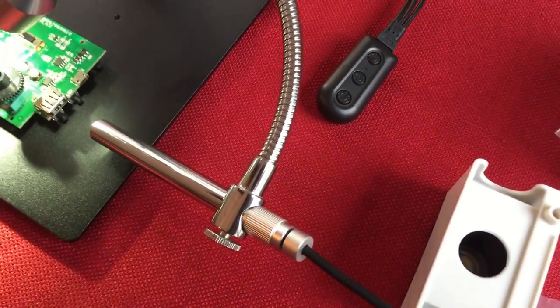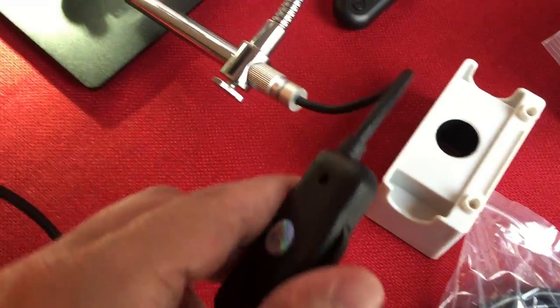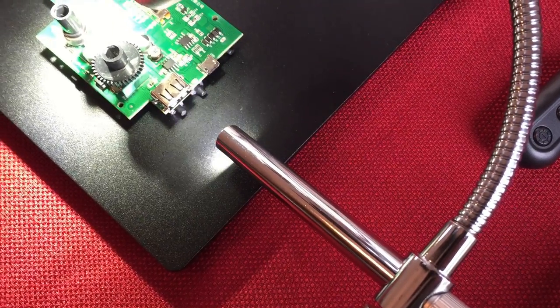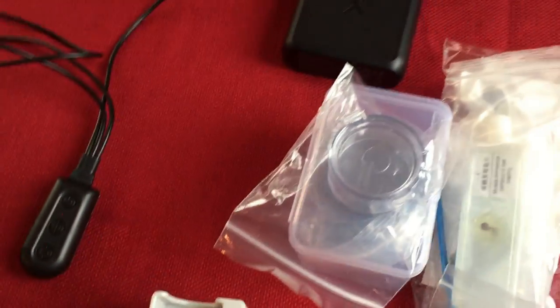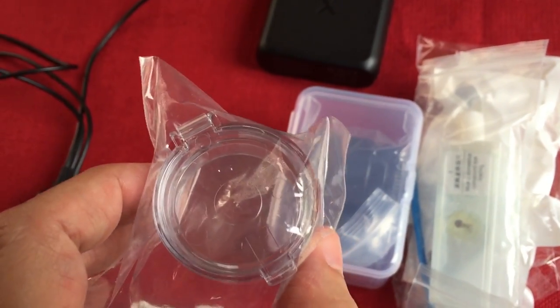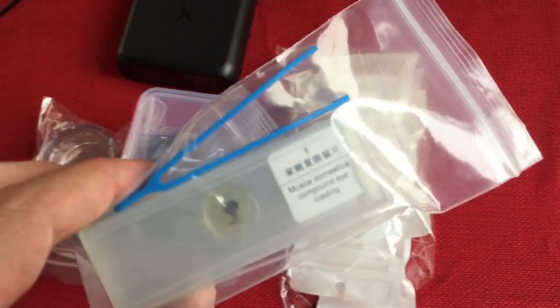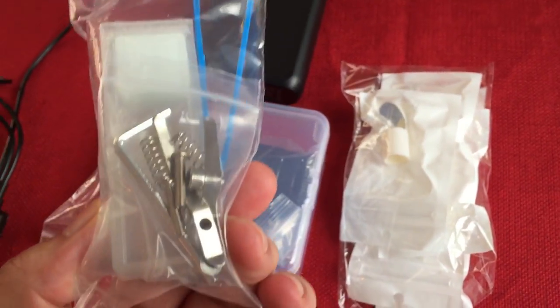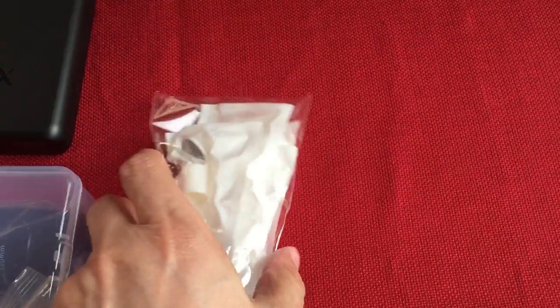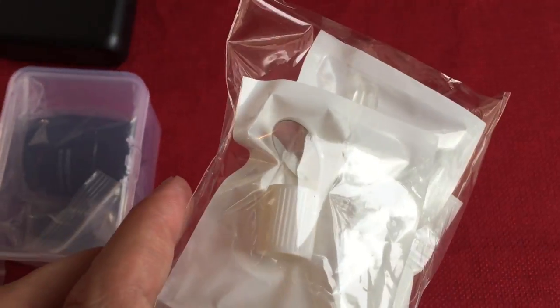There's the endoscope — very cool. It's got a row of LEDs in a circle around it, and the controller adjusts the brightness of those LEDs. They also include lots of accessories: a cool little box for putting small bugs in, a starter kit for looking at organisms, five slides, hookups for slides and objects, five different attachments for the endoscope, different tips to focus the light, and a mirror.